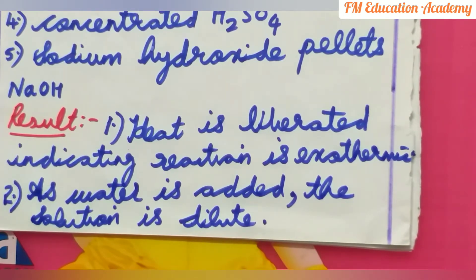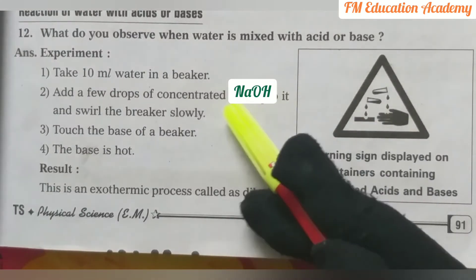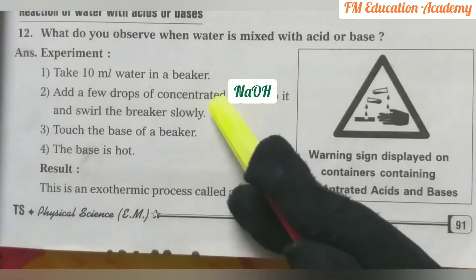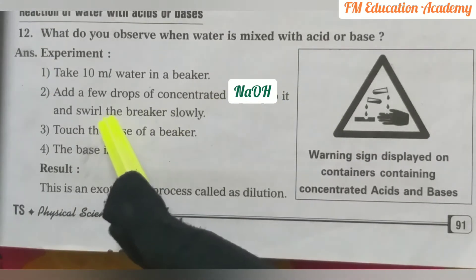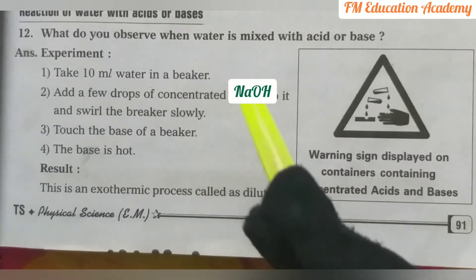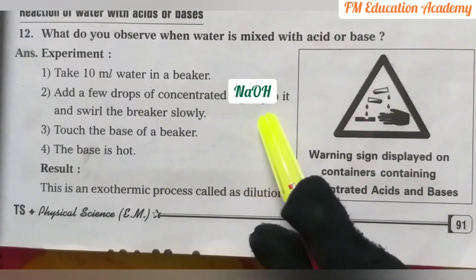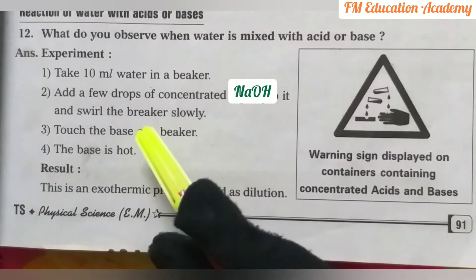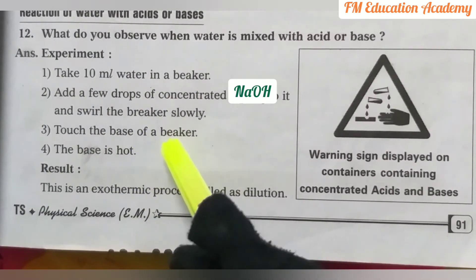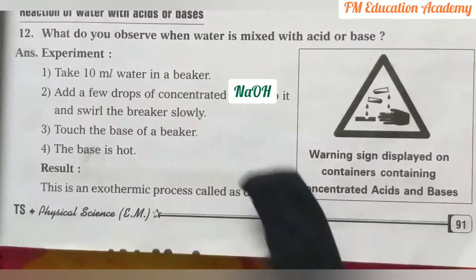Now we will perform the same experiment with sodium hydroxide pellets (NaOH). We take about 10 ml of water in the beaker, add a few drops of concentrated NaOH, and slowly swirl the beaker. After mixing, when we touch the base of the beaker, we observe it has become hot, meaning heat is liberated — which is an exothermic process.